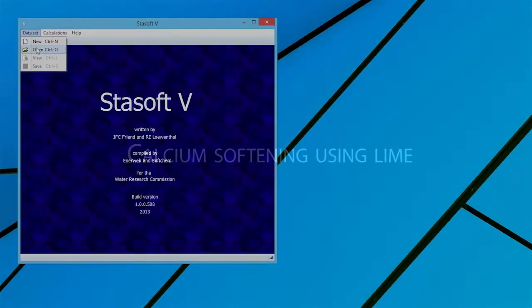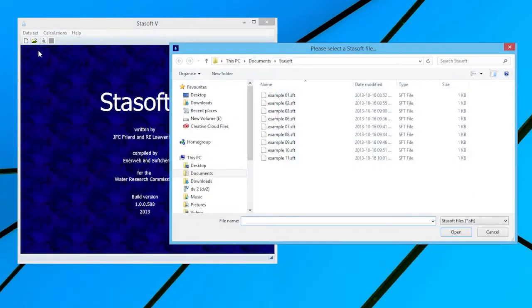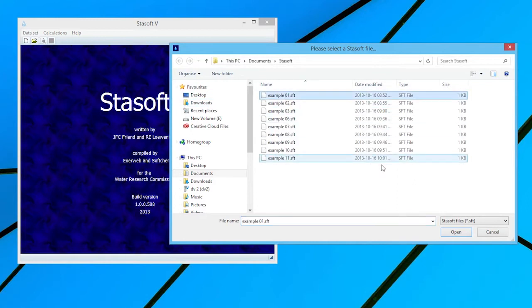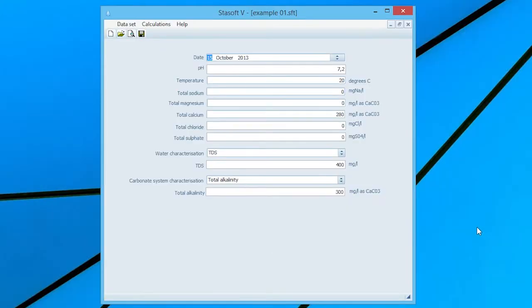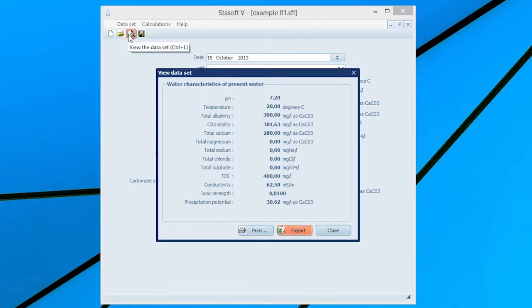Calcium Softening Using Lime. Select a data set as described in Example 1 in the StaySoft 5 manual. After entering the data into the Data Set Input window, selection of the View option will bring up the window displaying the characteristics of the present water onto the screen.